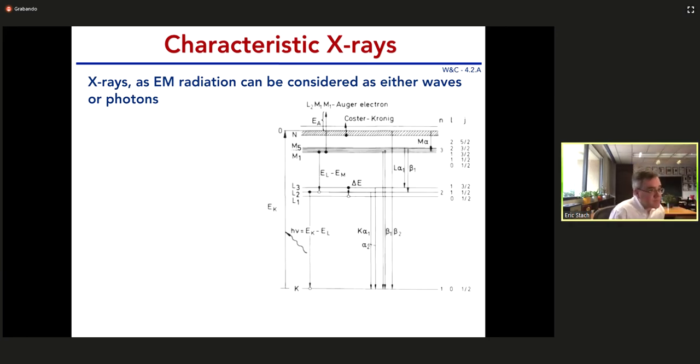Thank you so much. Okay, so Anicia, when you bring the electron beam in, you're basically taking this high energy electron, and it has some probability of interacting with electrons within individual shells. So if you have an electron that comes in and interacts with an electron that's in the deepest state, the K state, you can have a transition subsequently from an L2 state down to the K state. That's one way that that excited atom can be satisfied.